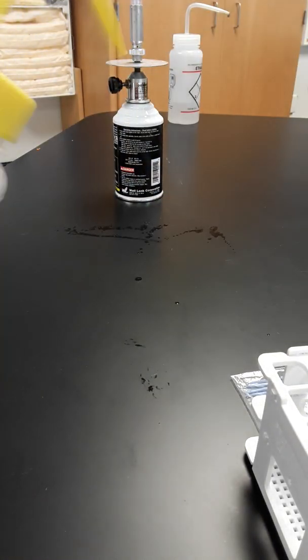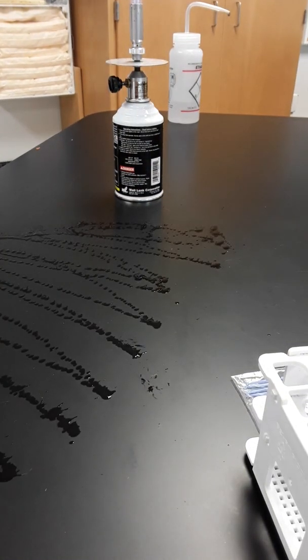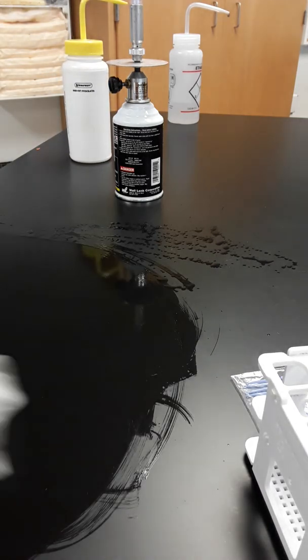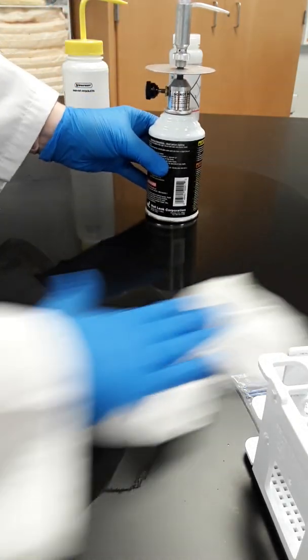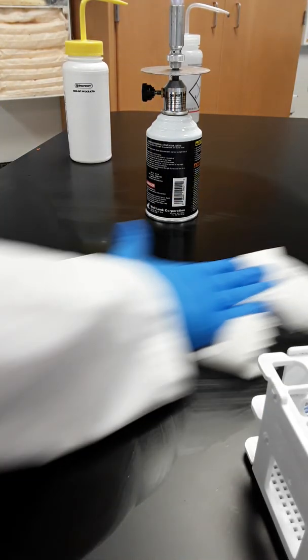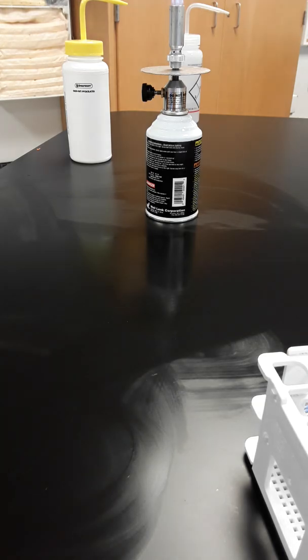because after you wipe down the counter, if you do not have a flame going, things are constantly falling onto your counter. So now I'm using bleach, and it doesn't matter what surface cleaner you use. I like to use one like bleach or ethanol because that does not leave a residue, but you can also use a table cleaner. It's not the cleaner itself, it's more the scrubbing action that gets rid of the bacteria.